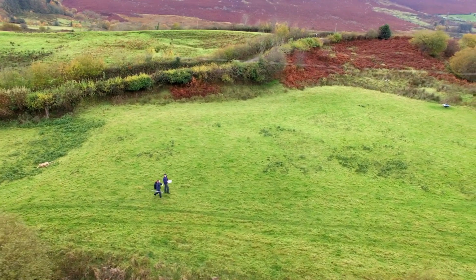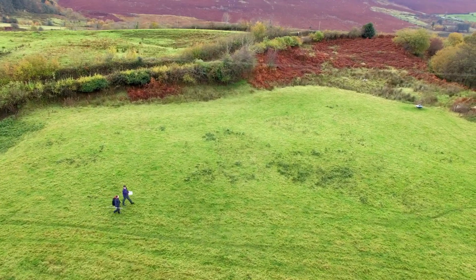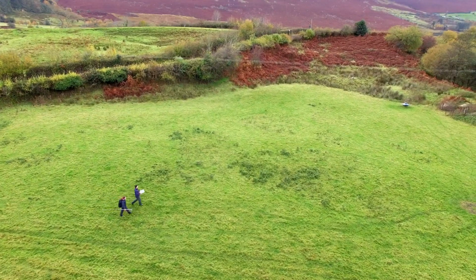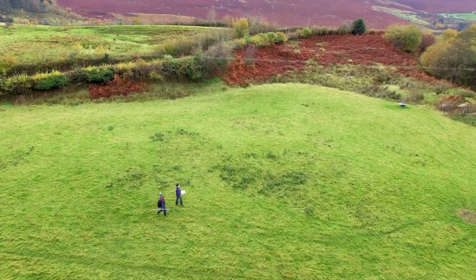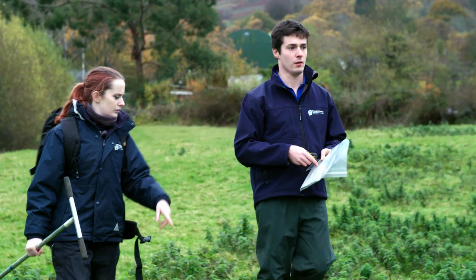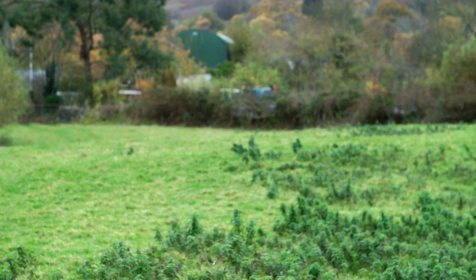The Tellus geochemistry field program requires the careful collection of soil samples. Care should be taken when selecting a soil sample site. Ensure the site is representative of the surrounding area. If possible, aim for a site central to your grid square, choosing undisturbed and unforested land where possible. Stay away from any evident sources of contamination.